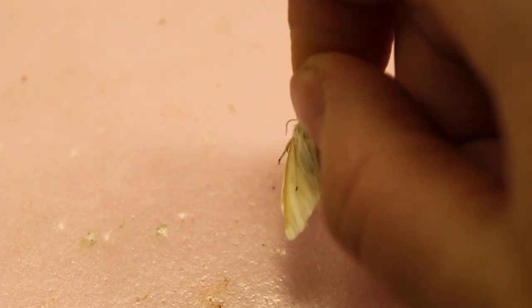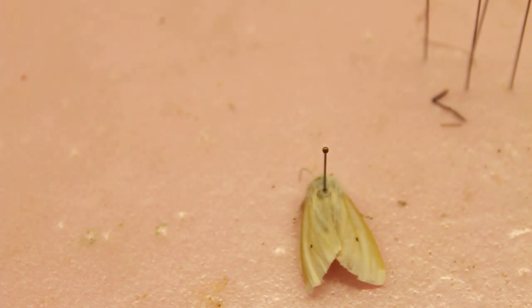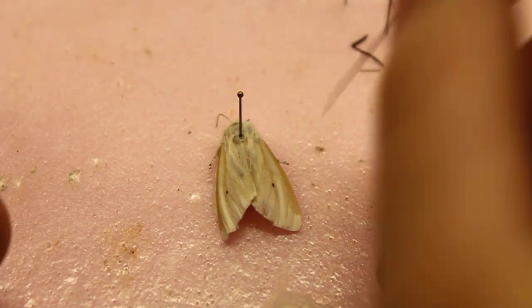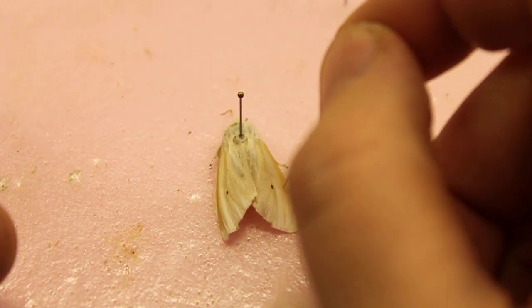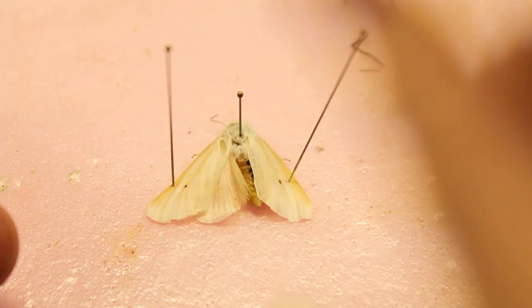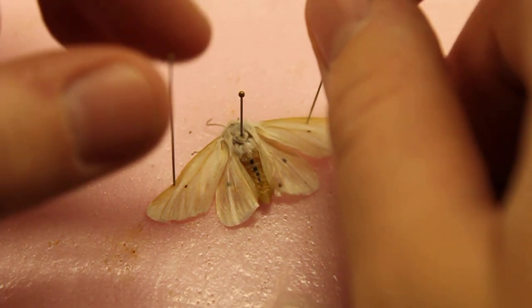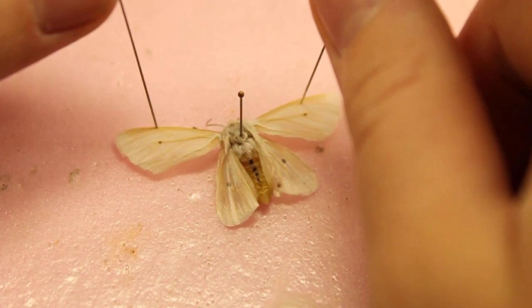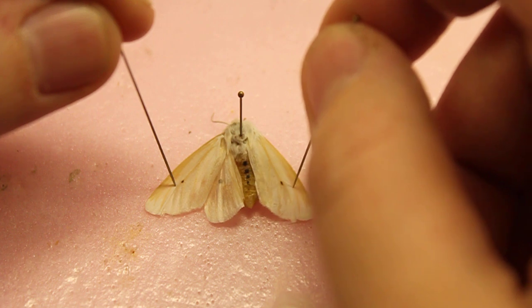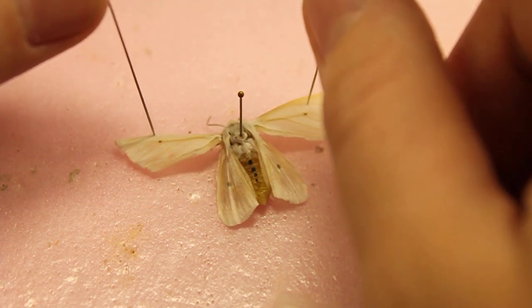Now we'll get to spreading the wings. You want to stick the insect all the way down into the foam. This takes a lot of practice — some people are really good at it, some people it take a little bit. With some insects you'll have to do both wings at the same time.